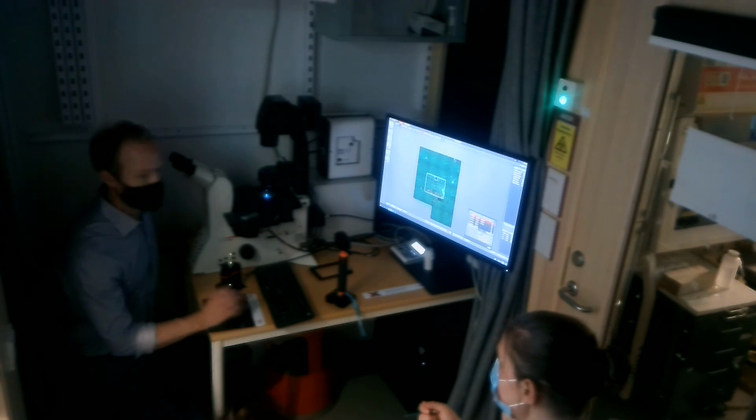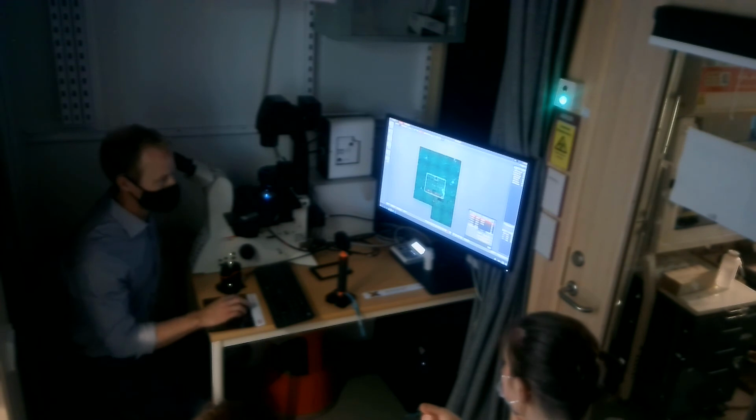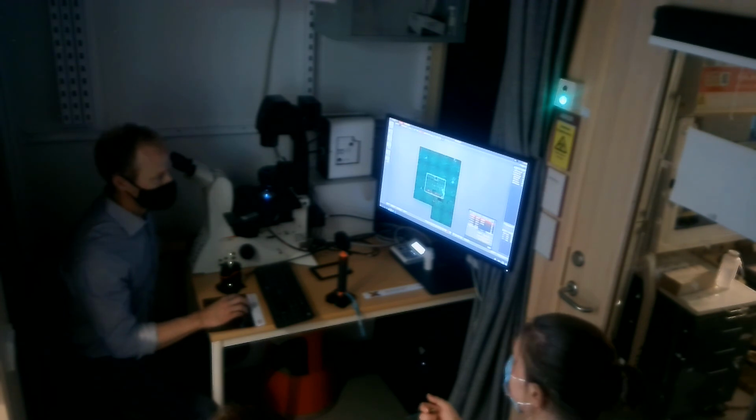So if you do more, it might not be geometrically a plane in the background, but for you it doesn't matter. You will just use your numbers, and anything in between will be interpolated.